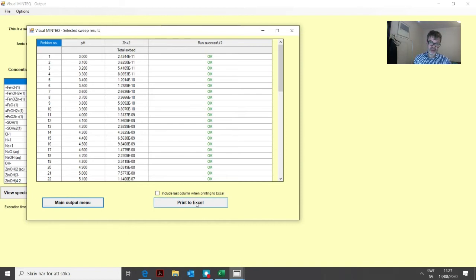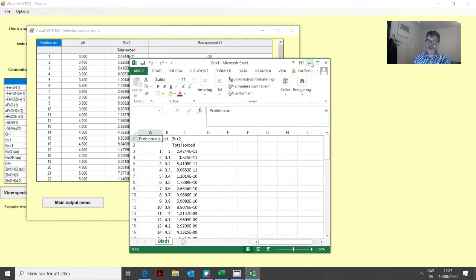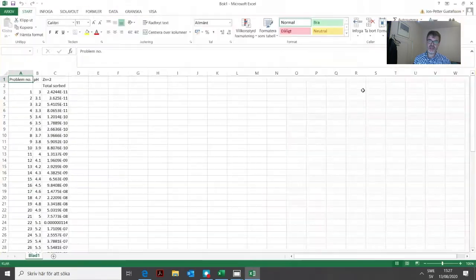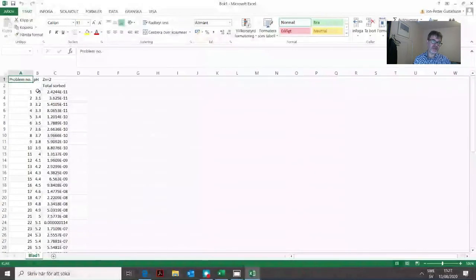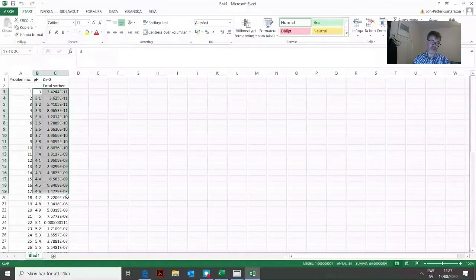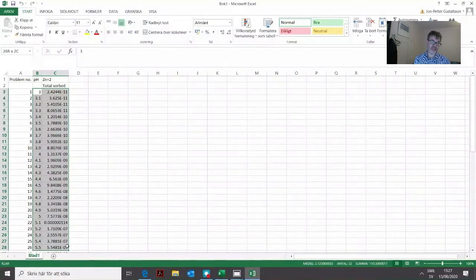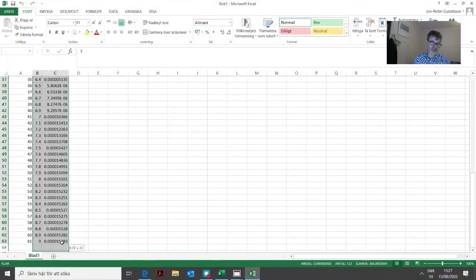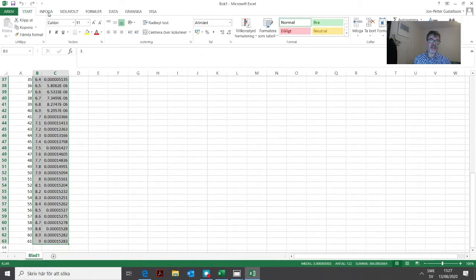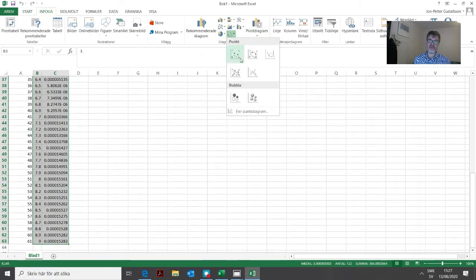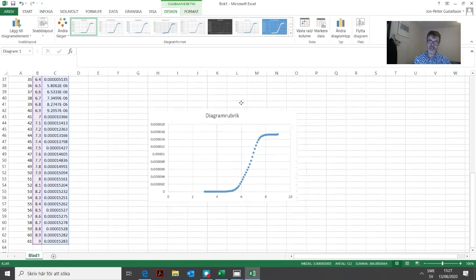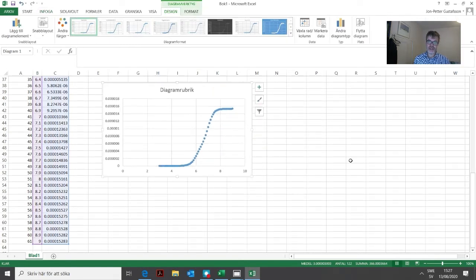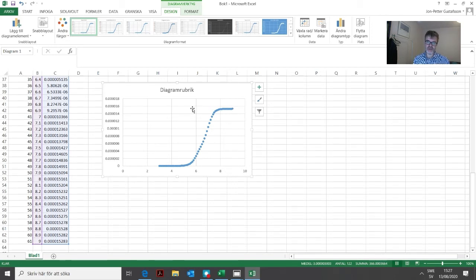We can print them out to Excel. Here we can make a graph. We can look at the pH dependence on the sorbed zinc. We mark these two columns and add some kind of graph. Here is our graph showing the sorption of zinc on this ferrihydride surface as a function of pH.